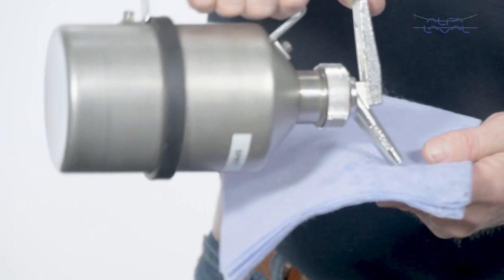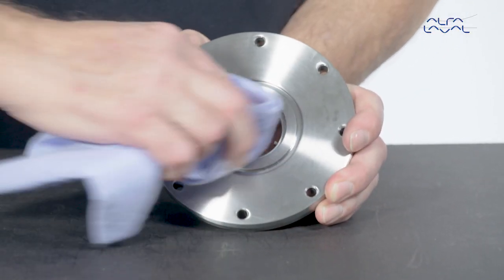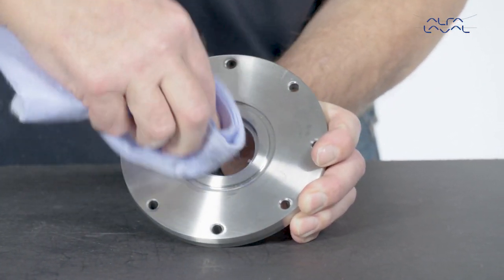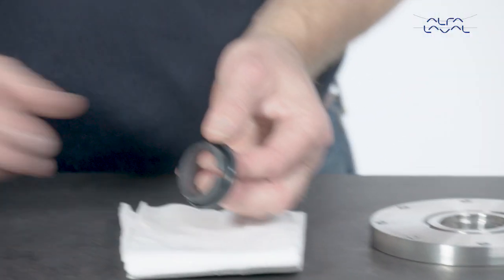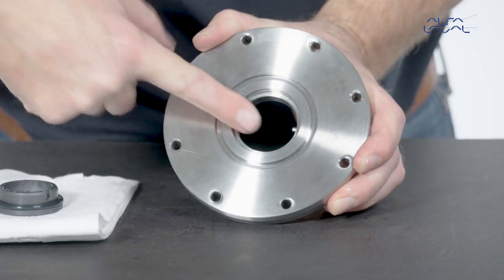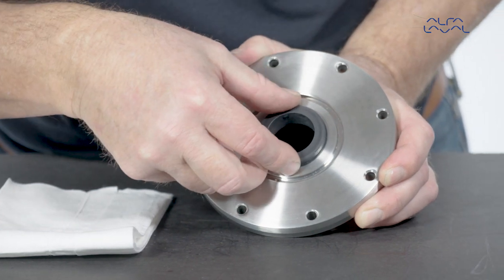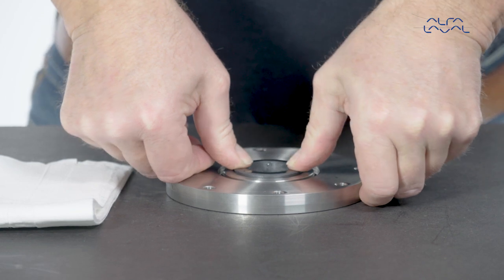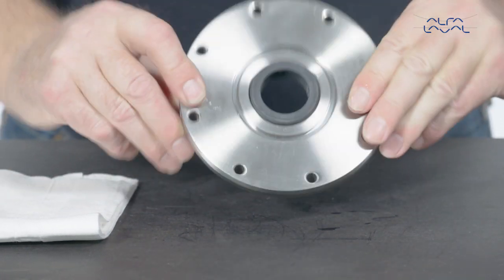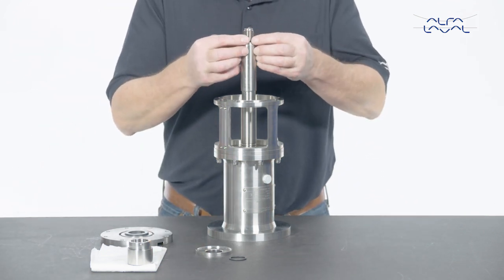Clean the surfaces of the flange and the shaft using alcohol to make sure that they are completely clean prior to seal replacement. Place the stationary seal part in the flange. Lubricate with water. Check that the pin is properly positioned. Gently press the stationary seal part into place. Replace the oil trap O-rings and mount the oil trap ring.